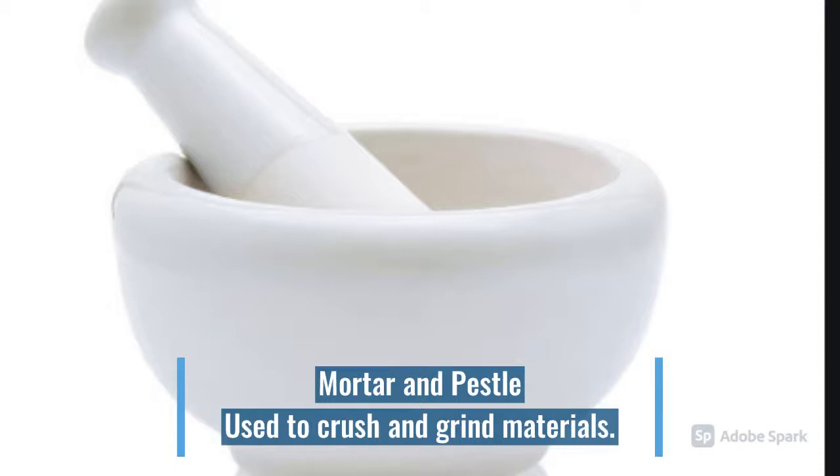Now, let's move on to the next section where I'll teach you how to correctly use these apparatus, especially when measuring essential base quantities such as volume, mass, and temperature. Let's start off by understanding how to use a cylinder correctly.